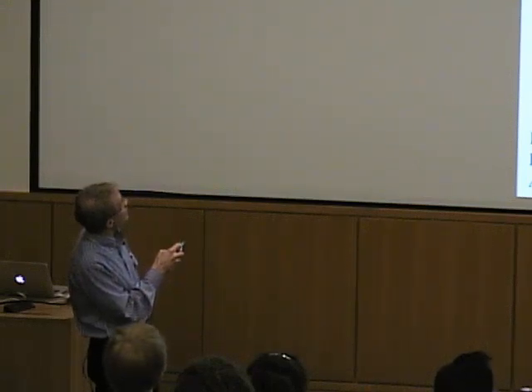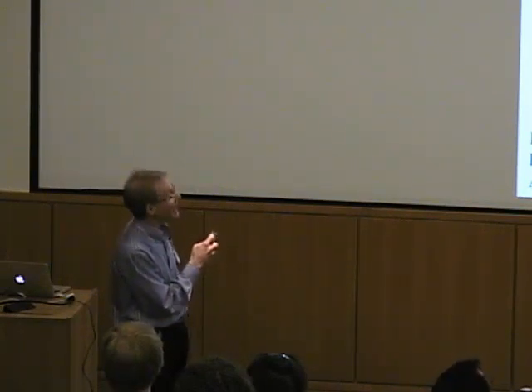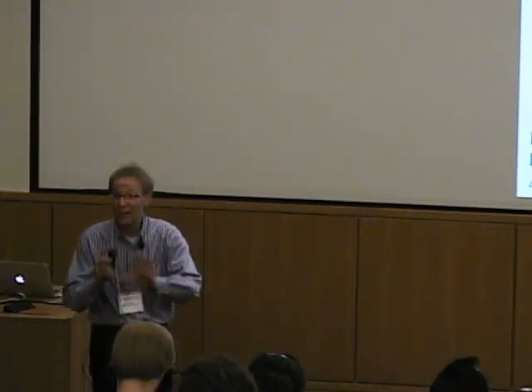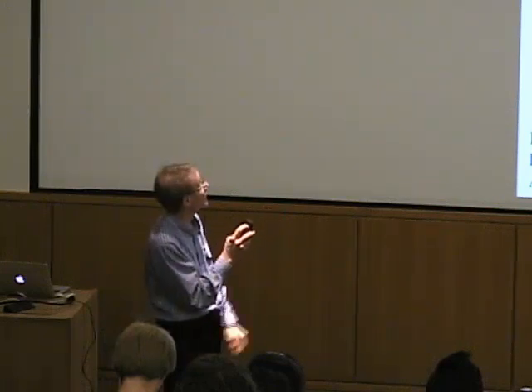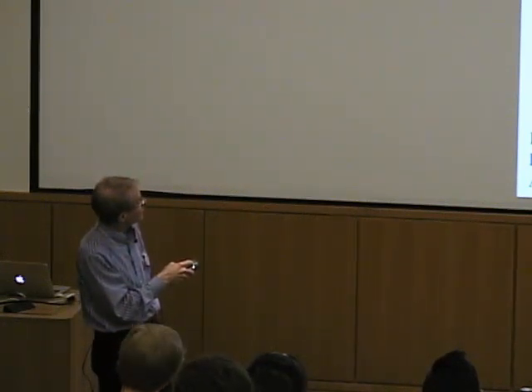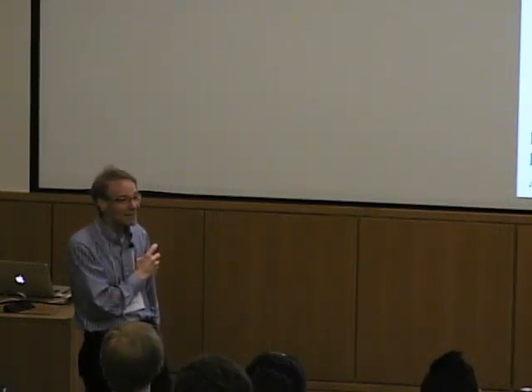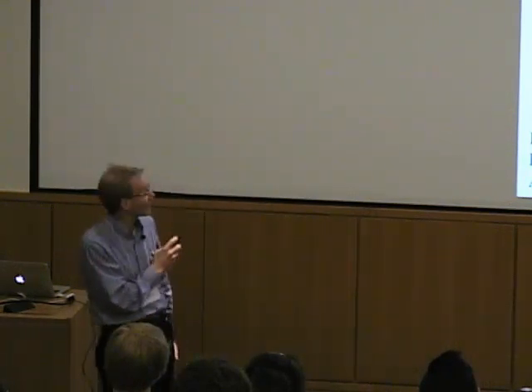Notice that the injection peaks are biphasic. They took a lot of time in analyzing those injection peaks to pull out the kinetics of that. Now, we're not going to be concerned about the kinetics. We're concerned about the thermodynamics. So here's the data, okay? Now, what do you think about the C window? Inside or outside the C window? That's kind of a step function, right? Pretty tight binding, all right?